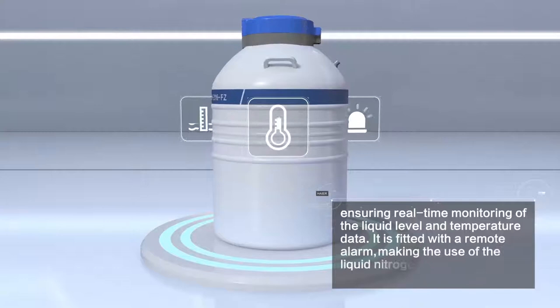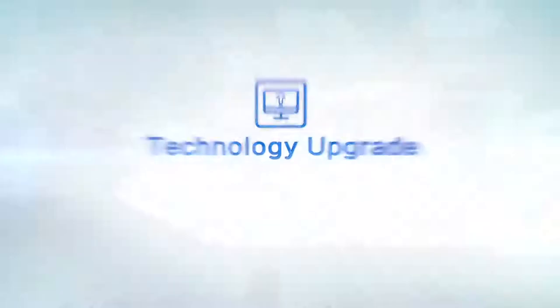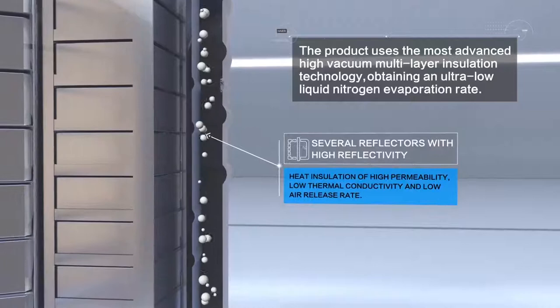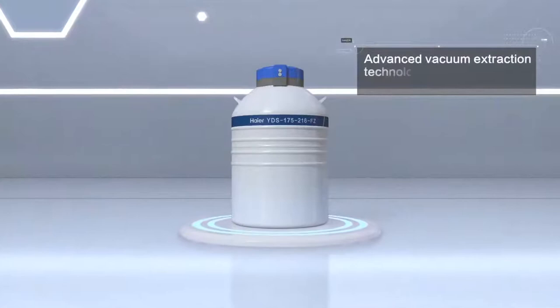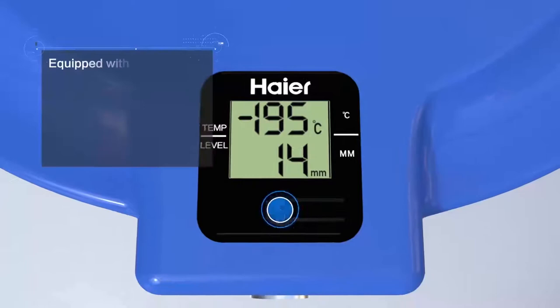It is fitted with a remote alarm, making the use of the liquid nitrogen container more safe and secure. The product uses the most advanced high vacuum multi-layer insulation technology, obtaining an ultra-low liquid nitrogen evaporation rate. Advanced vacuum extraction technology ensures the service life exceeds 5 years.